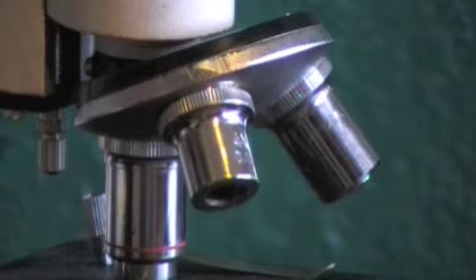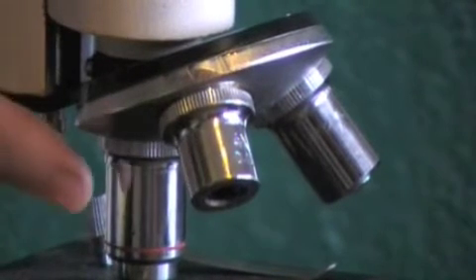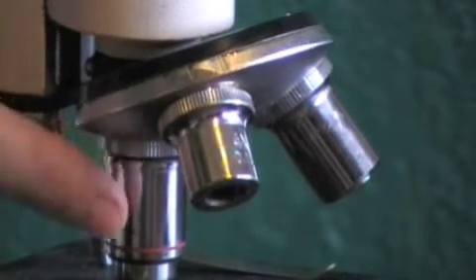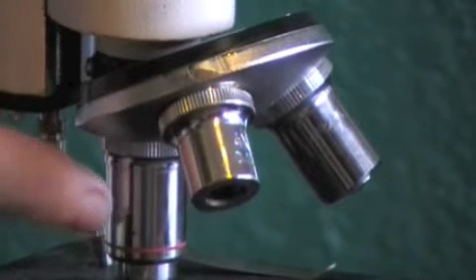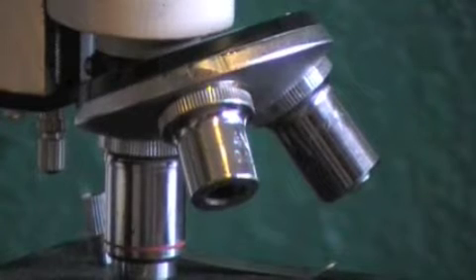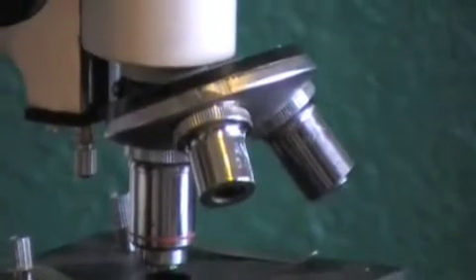So now you're going to focus it again, but be very, very careful. The high power objective lens is very, very close to your slide. If you focus too much, you'll push the objective lens into your slide and crack it. So be very, very careful whenever you're focusing with your high power lens. You're only going to want to move just slightly.